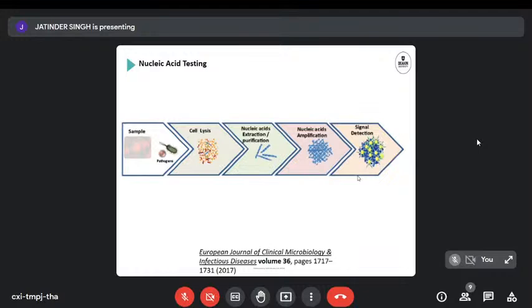with the mission of going to a microfluidic system where we want to minimize the fluidic handling to limit the compactness of our microfluidic devices. Keep in mind that a lot of the protocols that have been developed by the molecular biologists were all developed with the idea there would be gels around, there would be pipettes around, there would be centrifuges around, there would be fridges, there would be great infrastructure. What we want to do as a microfluidic community is take that knowledge, put it in a little bag and take it out in the field. But we don't want to take the fridge and the centrifuge and the pipettes and all the other infrastructure around.